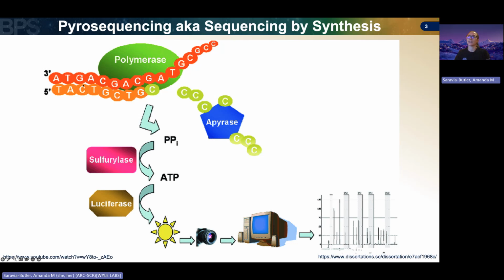So this was added on to our unknown sequence before the sequencing happened, and we'll get into how that works in later slides. Our sequencing primer, here in orange, is going to be hybridizing to its complement that is attached to our unknown sequence.